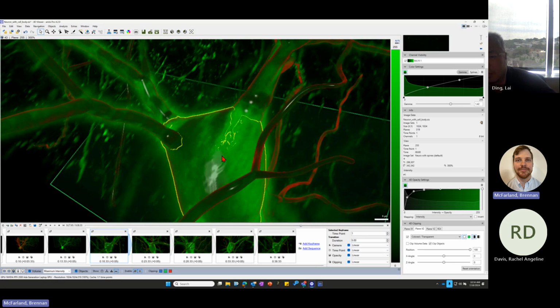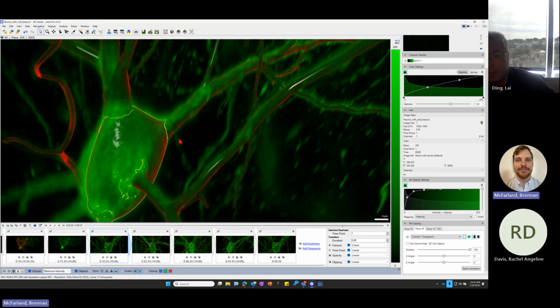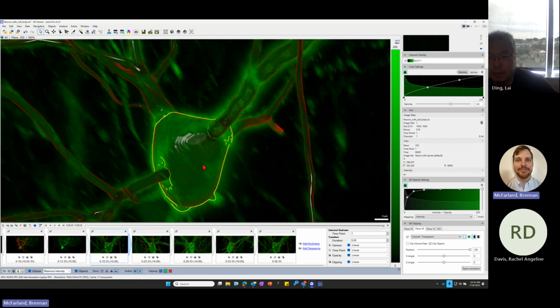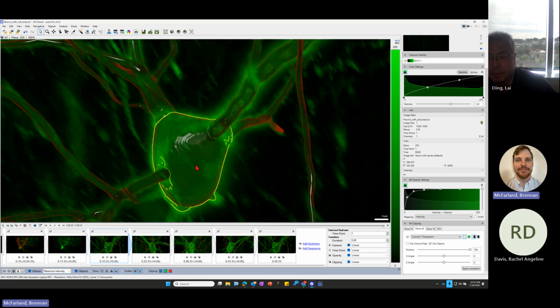You can see it shifts a little bit. It's moving around this, but it's not quite moving around it. It looks like it's moving around maybe a region right here. So that's where having the sequence helps to stabilize this a little bit. We can work around it. If we do more keyframes, we can get it to be pretty close, but the sequence is going to be the better option, I think. So let me make sure that we can do this with selecting an object, and if there's not, then I'll think of another way that we can get the same thing worked into the video.